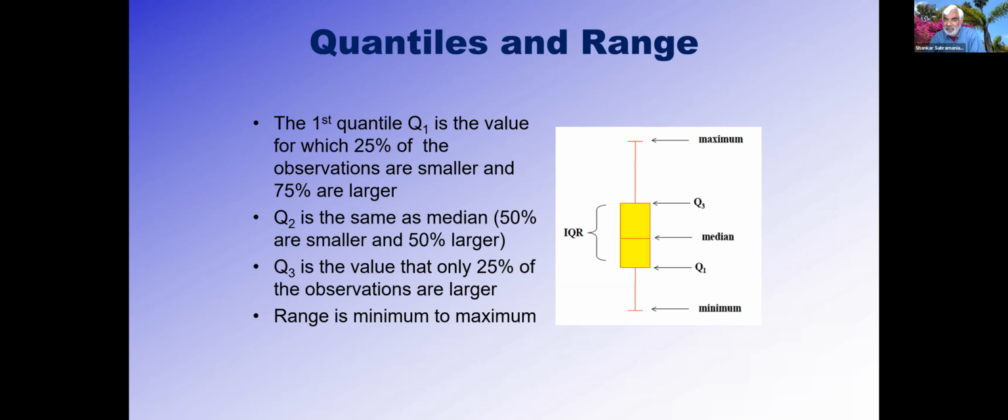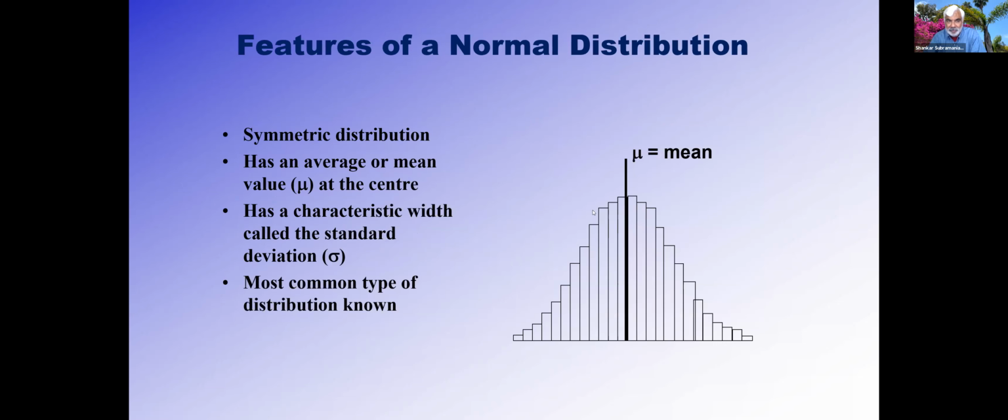So this is really an easy way of conceptualizing a large lipidomics data and saying, okay, these classes of lipids fall in this quantile. Now, when you talk about large measurements, for example, I take the same metabolite I'm measuring for 20 patients. I'm measuring glucose in 20 patients or cholesterol in 20 patients or 100 patients.